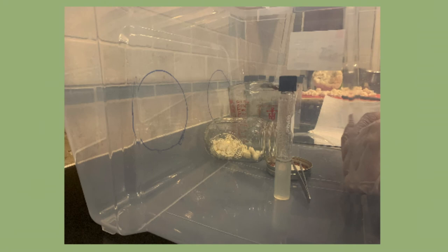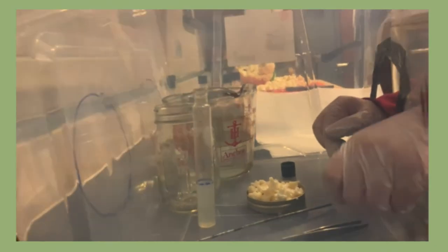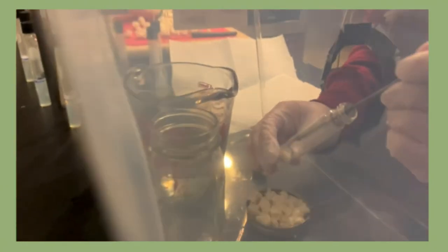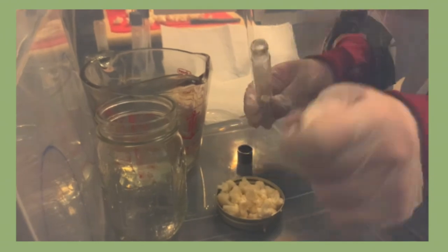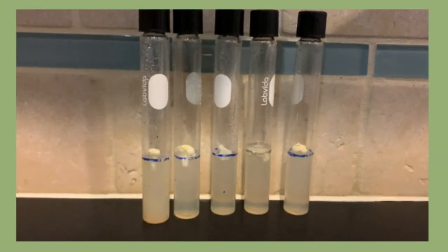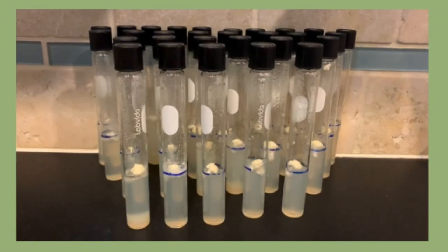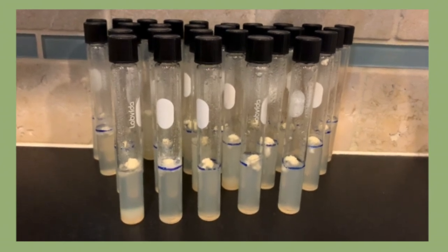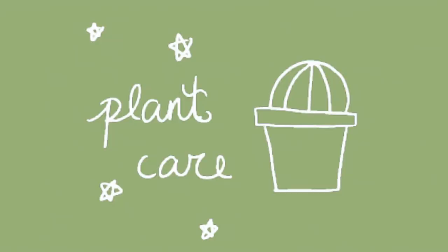Remove the empty mason jar and put in a test tube, tweezers, and long metal poker. Uncap the culture tube. Choose a floret from the group with tweezers and drop it into the tube. If necessary, use the flat part of the tweezers to push the floret through the opening. Then, use the poker to submerge the floret halfway into the medium, stem facing downwards. Seal the tube and remove from the plastic box. Continue to pass in tubes one by one until there are none remaining. It is important to remember to seal the tubes before taking them out to keep them as sterile as possible.